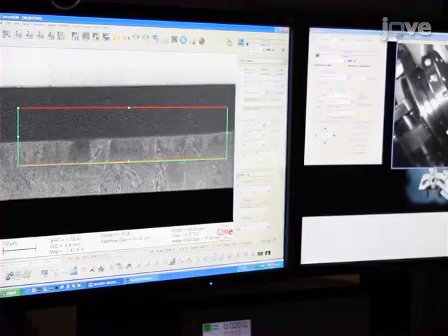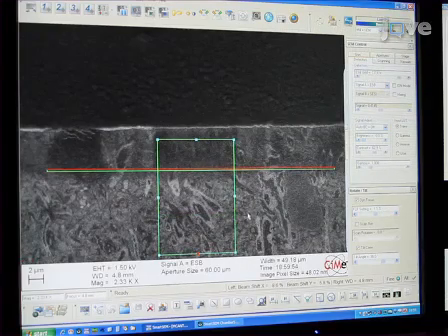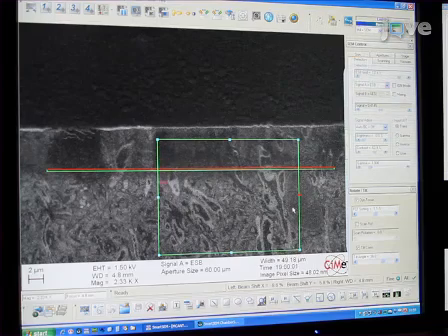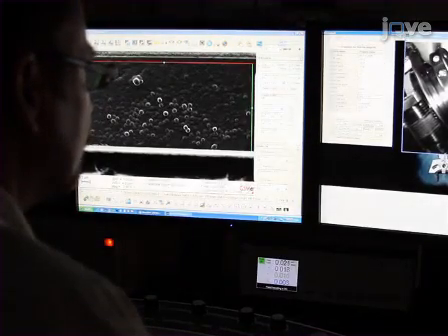Using a current of 700 picoamps, finely mill the region of the block within which the final images will be taken. Allow the milling beam to completely mill this image face until no milling artifacts can be seen on the face. Select the microscope parameters for serial imaging of the face.